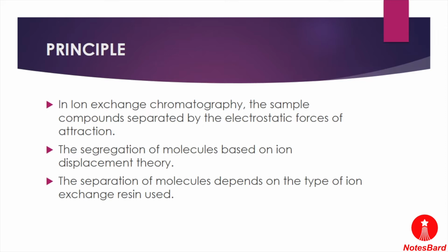The separation of these molecules is based on the ion displacement theory. According to the ion displacement theory, the weaker ion is displaced by the stronger ion. Hence, the separation depends on the type of ion exchange resin used in the method.